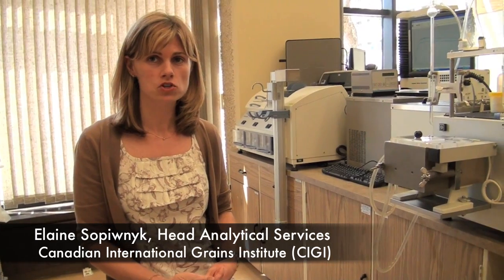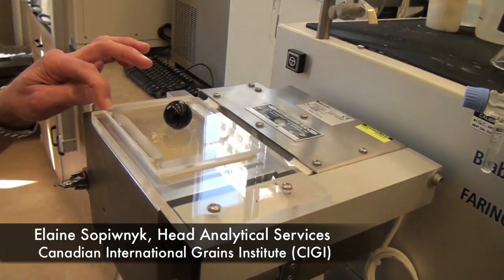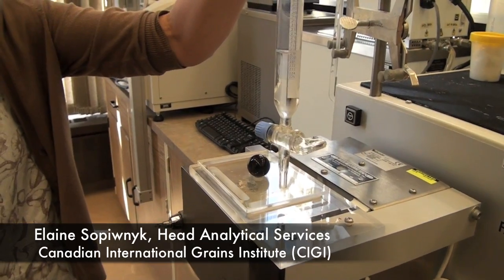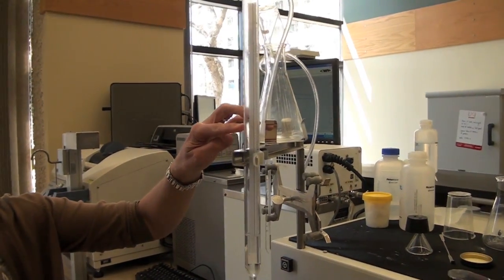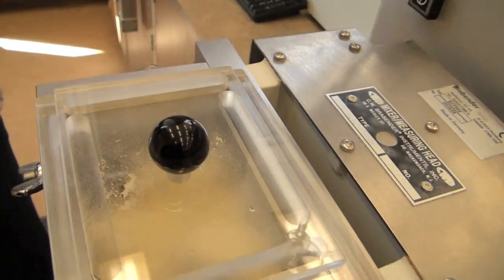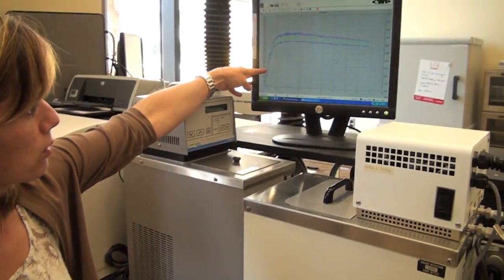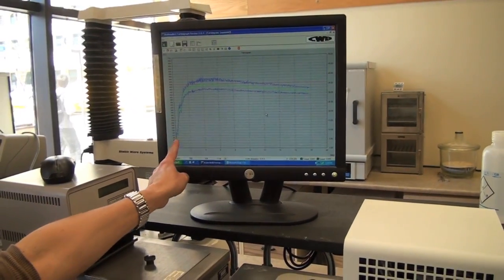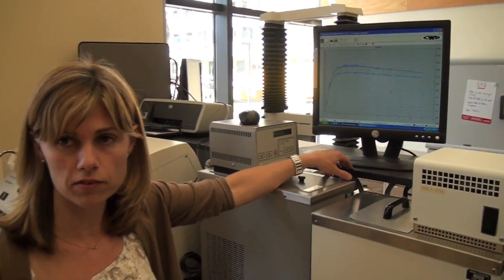A farinograph is a piece of equipment that measures the rheological properties of a dough, which is primarily made of flour and water. Inside the bowl of the equipment, we would place a weighted amount of flour. We would then add water to the bowl using this burette that's calibrated in milliliters and absorption. As the water is added to the flour and while the sample is being mixed, we're collecting data on the software by measuring the amount of torque that's sensed on the mixing blades. It's kind of like a viscosity measurement — the amount of force or torque being sensed by the blades as they mix the sample.